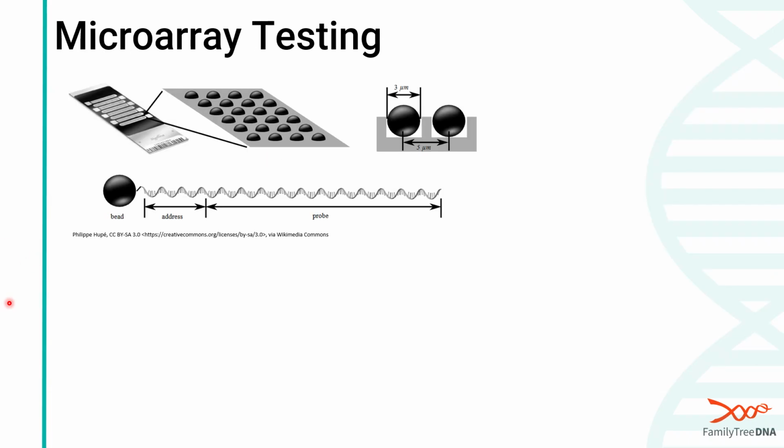And if you want to test them in all of these different areas, then instead what is ideal is something called microarray testing. Now, microarrays, they work, I guess, sort of similar to next-gen sequencing in that you have a chip that has these primers on them. Only this one's a little bit different. It has what are called probes, because you're not looking to start at a location and go from there moving forward.